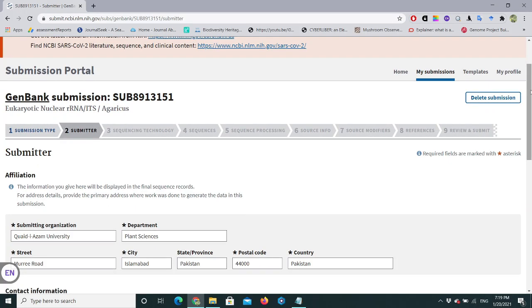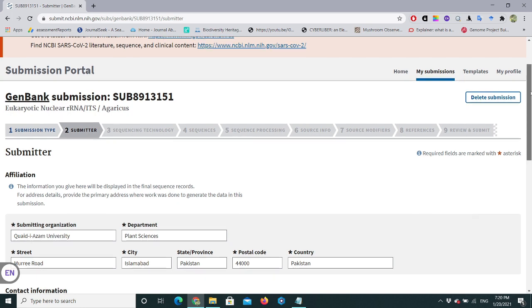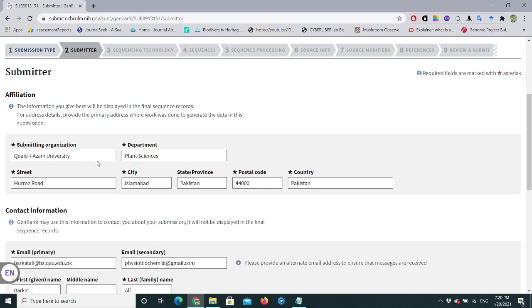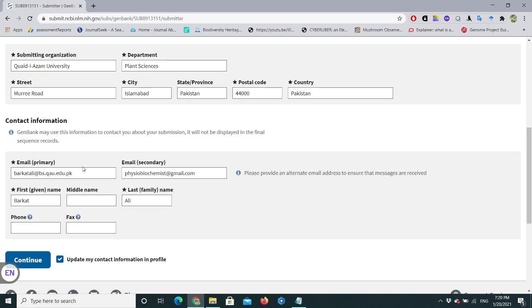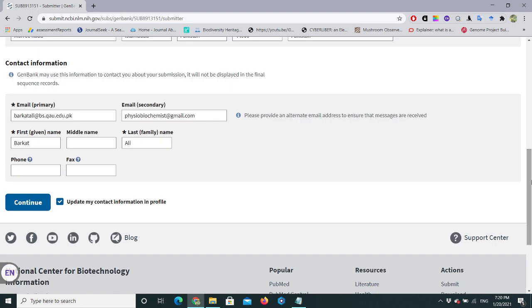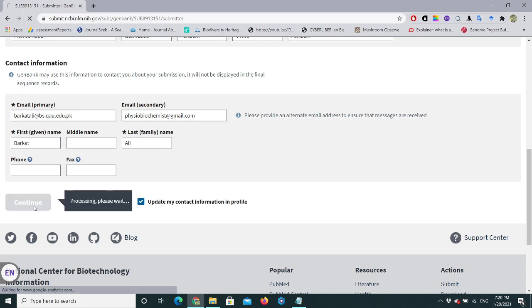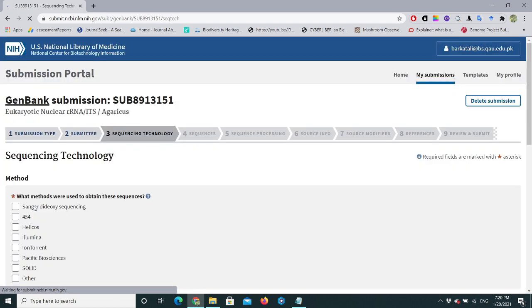This is the second page — the Submitter section. You need to put your information about your institute, contact details, and address. I have already entered my details: institute, address, and contact information. You can provide primary and secondary emails, then click Continue.